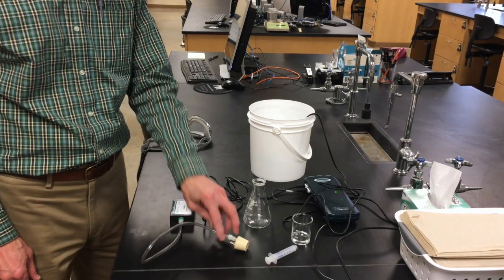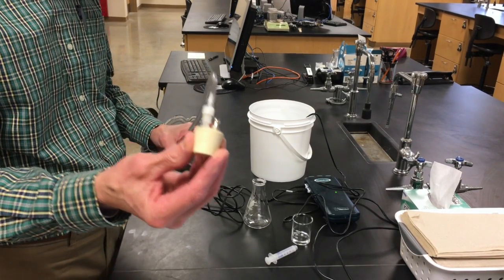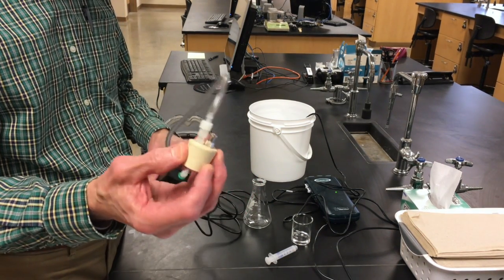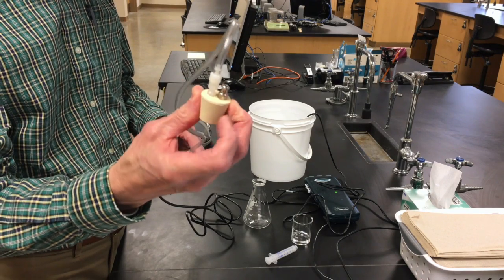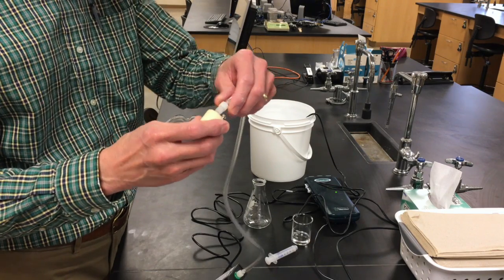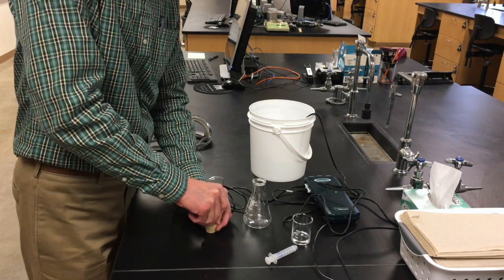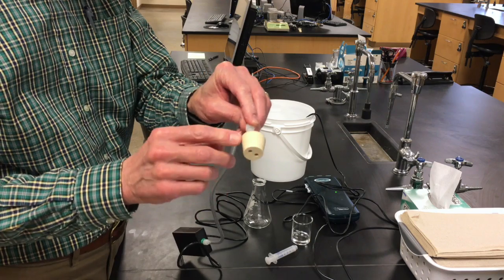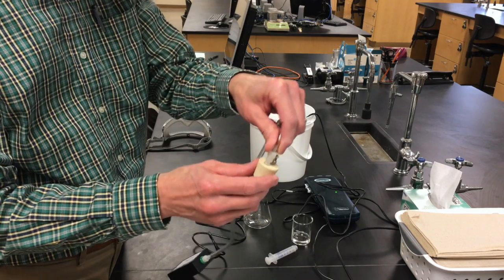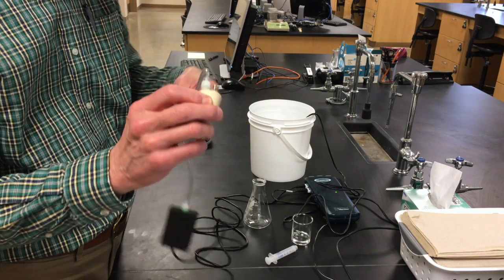All right, here is the two-hole stopper that's going to go into the Erlenmeyer flask, and you'll notice that one of the ports on the stopper is plastic, the one on the left here, and the one on the right is a metal one. Be sure that these are well pushed in. You might even want to put this down, the plastic one, and make sure it's pushed in there really well, because the plastic one can tend to work itself a little bit loose over time. But if it's pushed in good like this, that's great. That should seal very well.